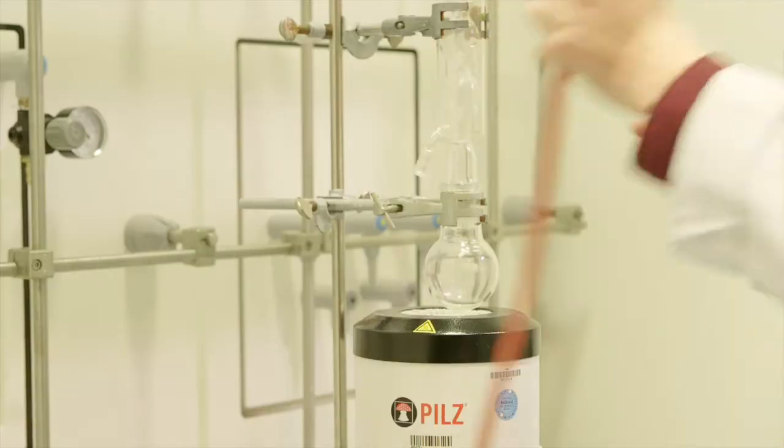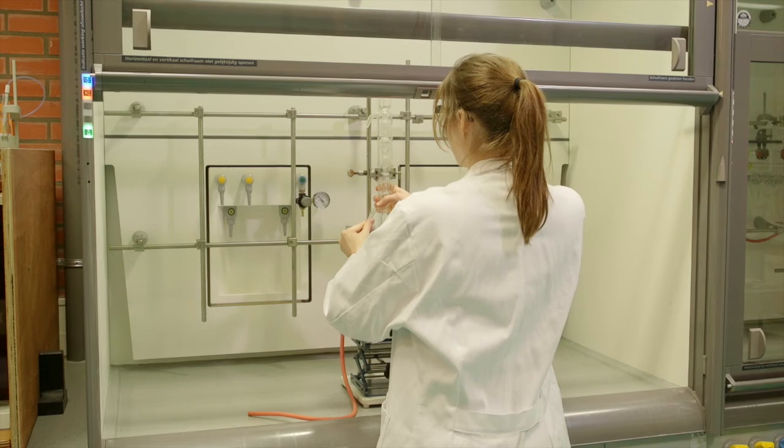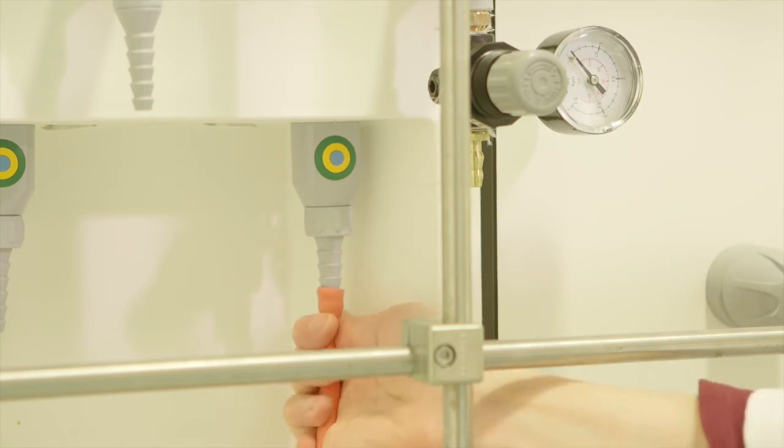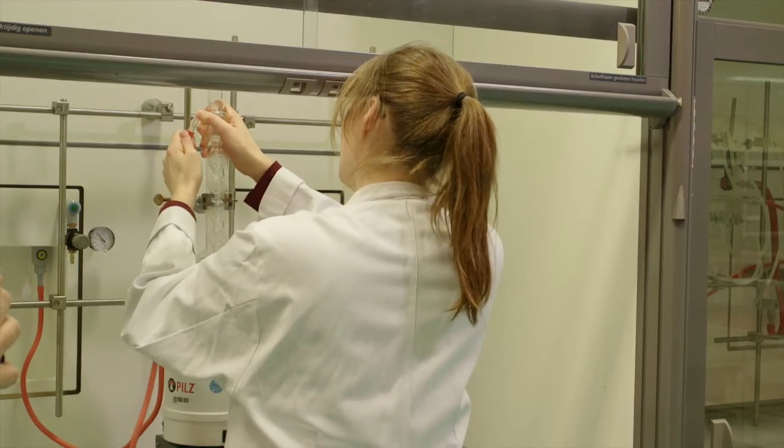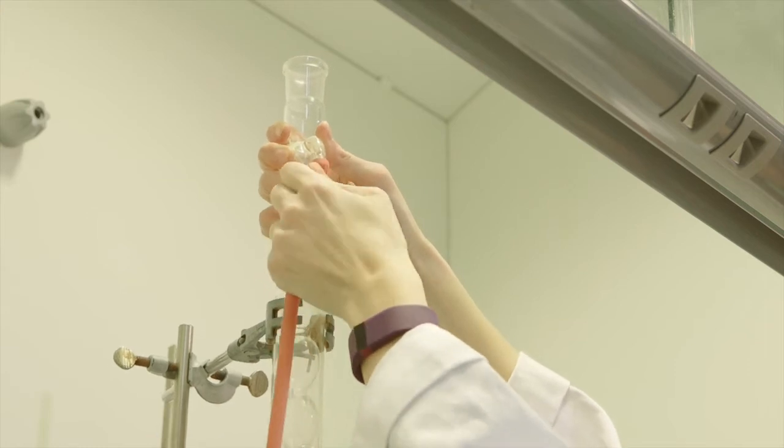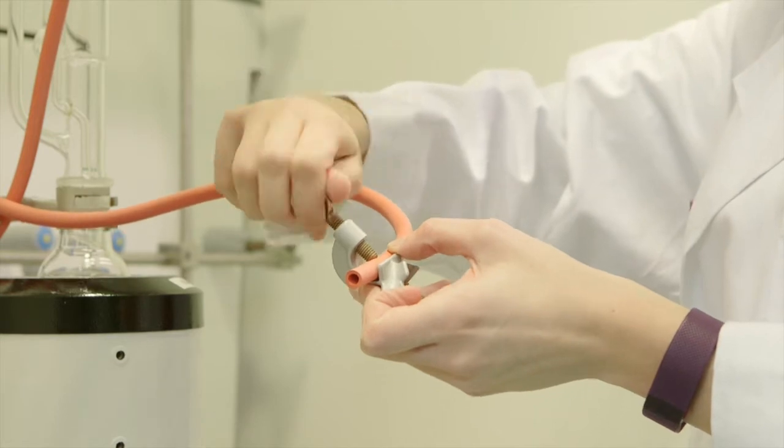Attach a tube to the lower port of the condenser. This is where water will enter. Attach the other end of this tube to the tap. The water will flow up when the tap is turned on. To drain the water, the second tube is attached to the upper port of the condenser and the other end placed in the sink drain. If the tube doesn't stay in the drain, it can be weighed down by a part of the clamp.